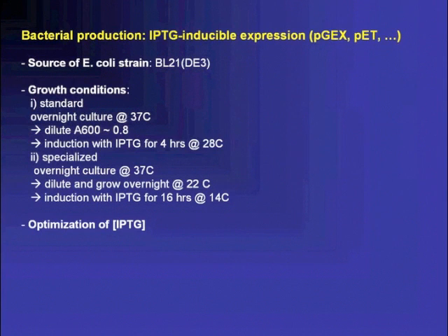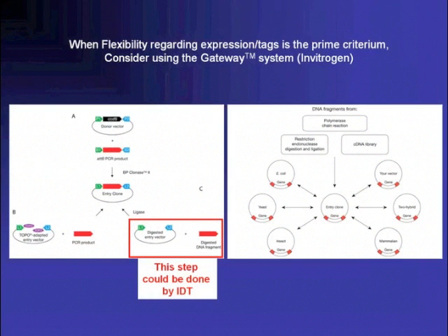Okay. Somebody's asking, what about post-translational modifications in bacteria? That might be an issue, or rather the issue might be that your post-translational modification is not present. Let's say if your peptide is only active when you have a modification, likely it will not occur in bacteria, for instance phosphorylation. So what we recommend is that you would either make a phosphomimic. If you really want to do the phosphorylation, you could make the serine into an aspartate or glutamate, or, as I explained, you might consider using insect cells or even yeast cells.